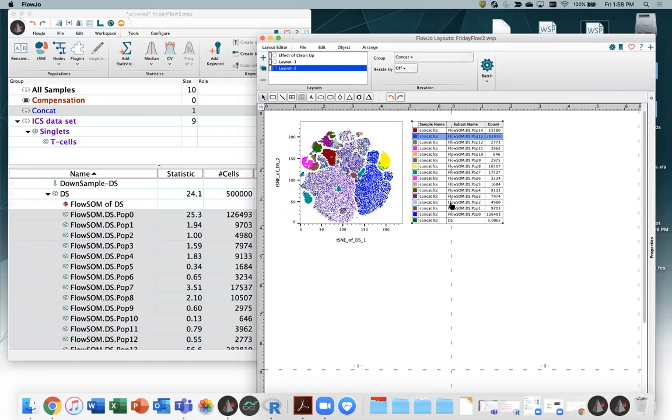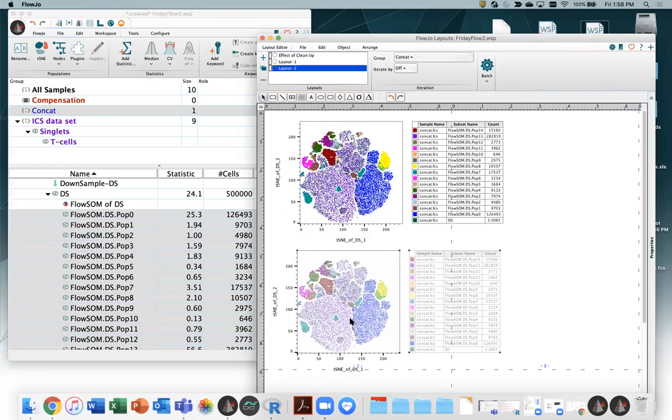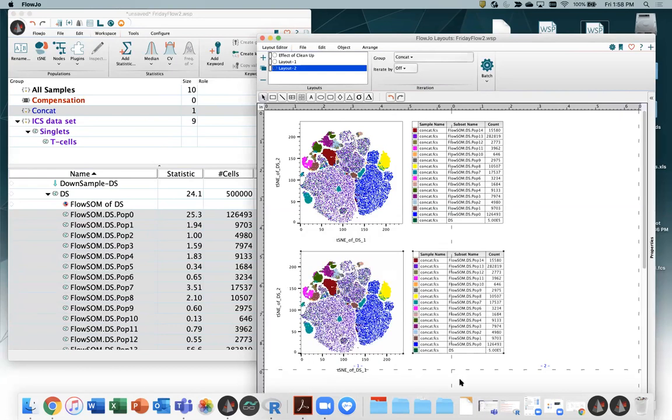Yes? I'm actually going to ask another question. So speaking of that, with number of cells, is there a minimum threshold that you recommend for a population, and how would you tackle extremely rare populations that people might be looking for, like 1 in a million type cells?